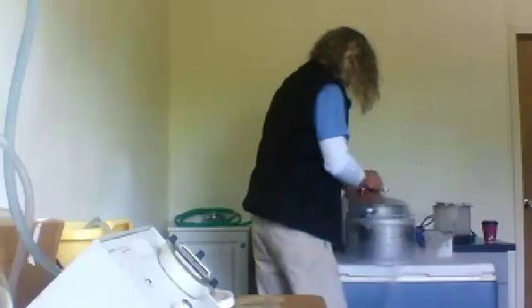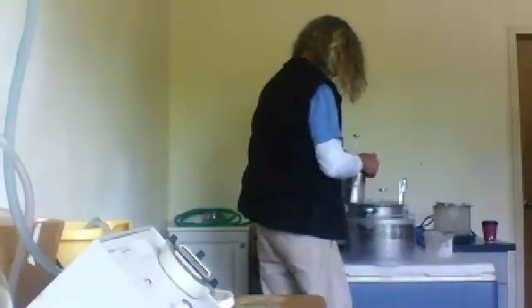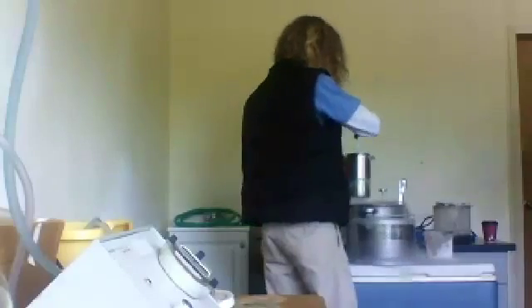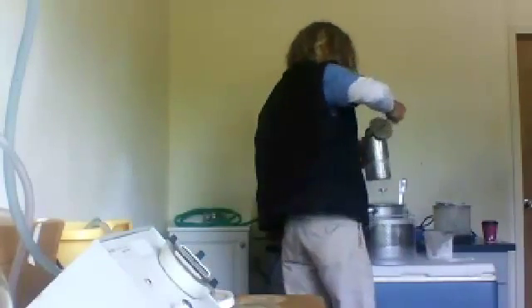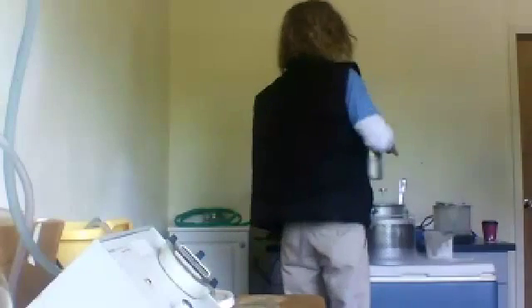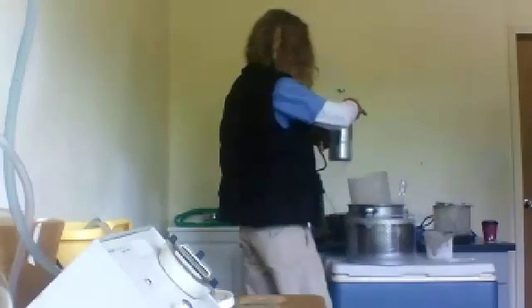Now, is that a finished extract you're adding your liquid nitrogen to? Oh, this one here? And there's your alcohol in there in the French press, right? Yes, correct. What I'm doing is just moving the product in there. You're going to redissolve it back into alcohol and freeze it so the fats separate. Absolutely. Yeah, winterization, over and over again. Just so the people know what's going on. Yeah, that's great, brother.